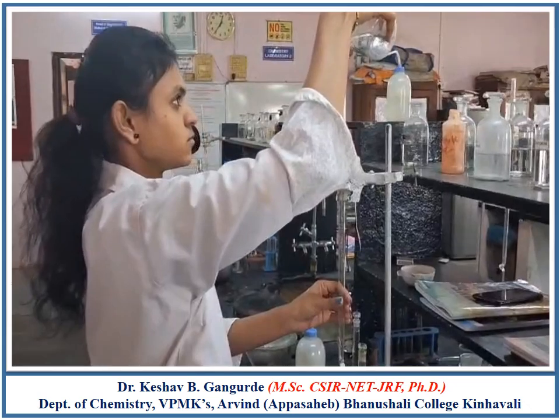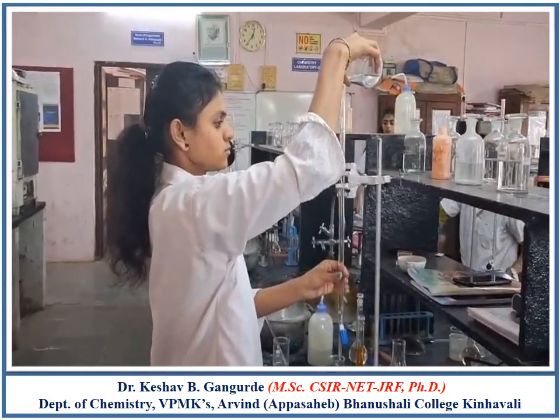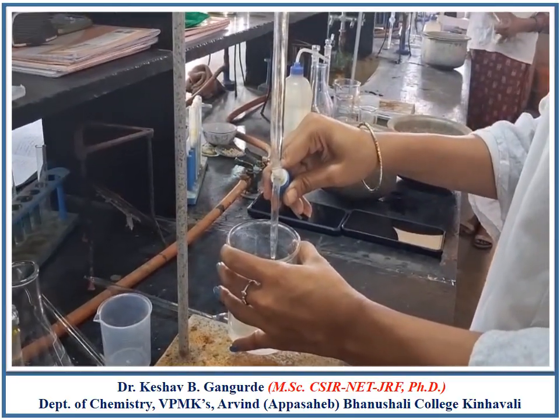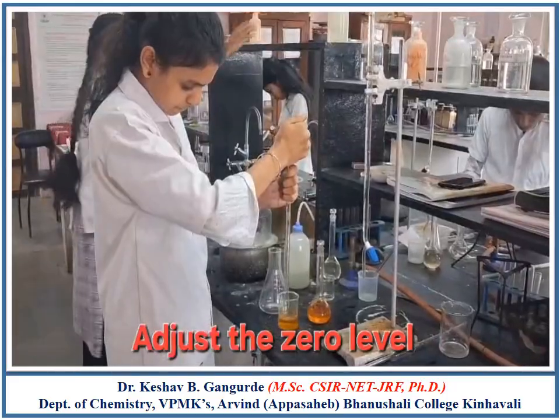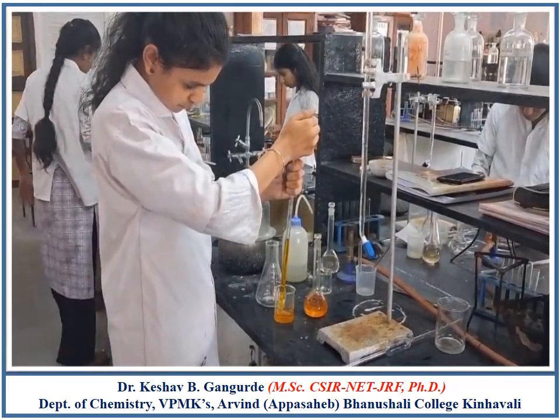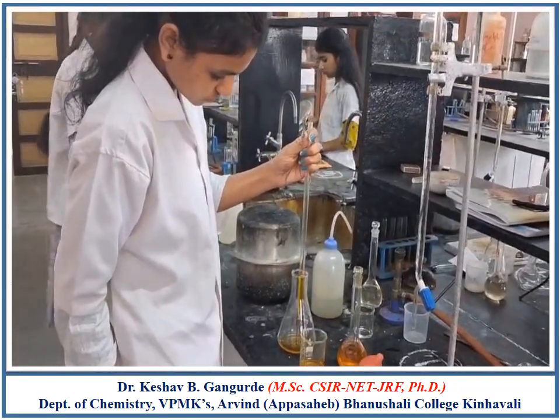Now fill the burette with 0.1 normal sodium thiosulphate solution. Remove the air bubbles to release the solution suddenly by opening the knob. Adjust the zero level. Now pipette out 10 ml of 0.1 normal potassium dichromate solution in 250 ml conical flask.